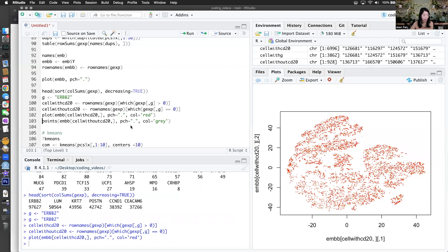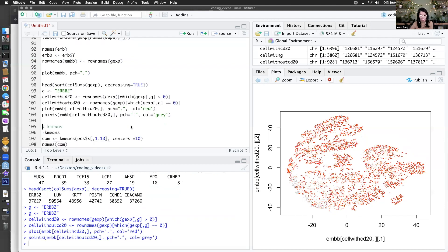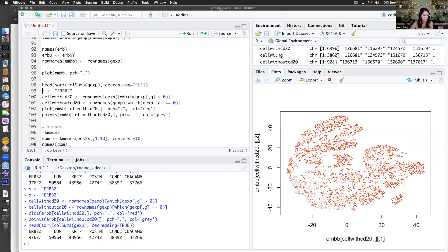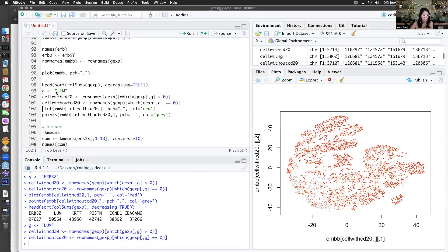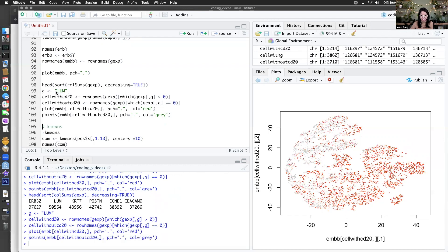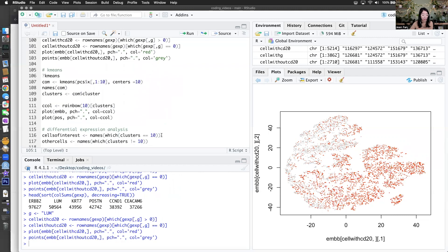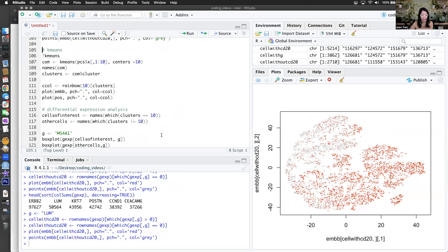So we have cells with RTU2 and cells without. Maybe I'll pick something slightly less highly expressed — what about this one, LUM? It kind of tends to be higher here and maybe lower here. The reason I'm doing this is just so I can sanity check that our differential expression analysis is going to return relevant results. So if I pick a cluster here and compare it to these cells, it should pick up LUM as being upregulated. Let's see.